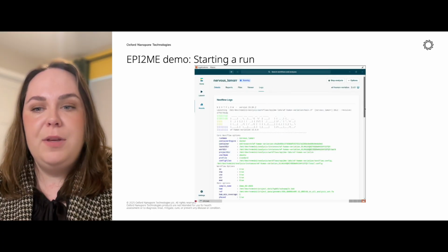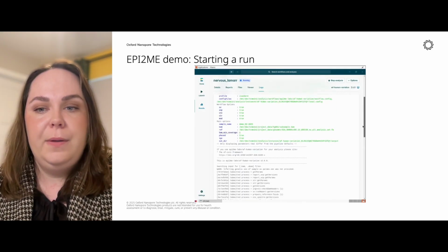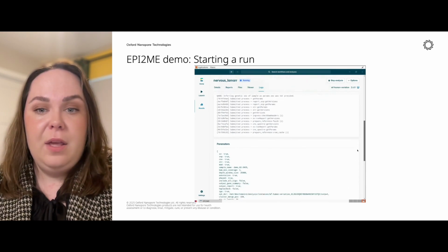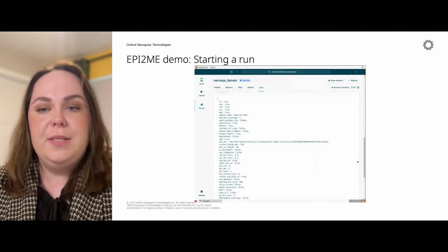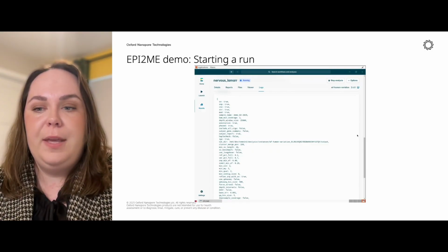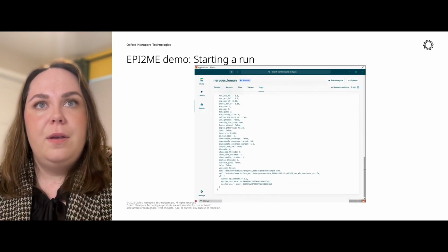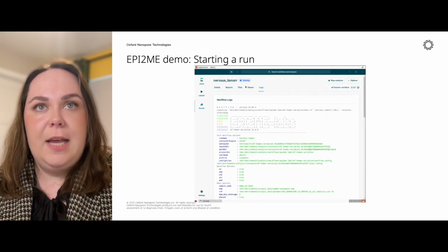Again, you will see the submission of the jobs via their standard names that are defined in the workflow code. In the panel underneath the log, you will see the workflow parameters that were configured during setup and some that are set as default by the configuration file of the workflow. Output files are listed as they are generated on a different tab called Files on the top left.